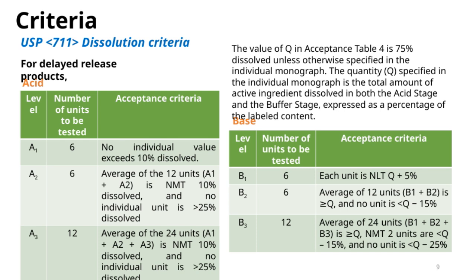So, whether we're looking at initial release or delayed release products, these standards help us confirm that the dissolution behavior aligns with the intended therapeutic profile.